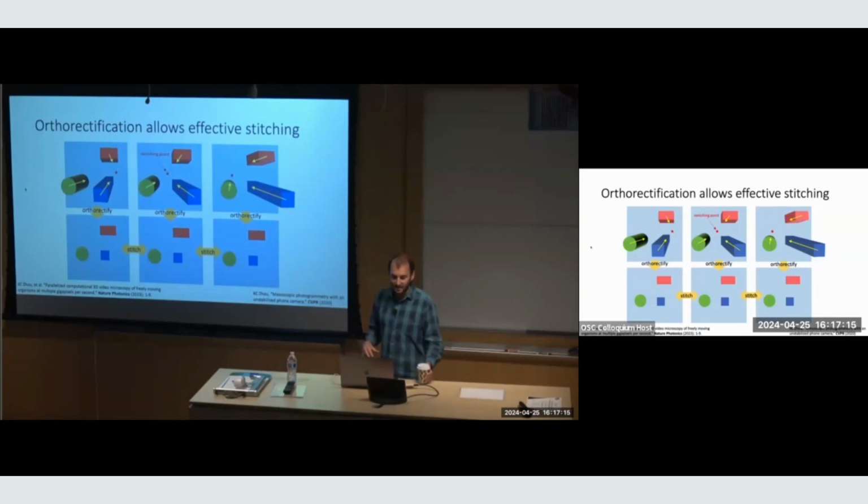So I didn't invent this term either, but I like it. I call it 2.5D imaging, really, is this regime, right? It's like RGB depth type 3D.